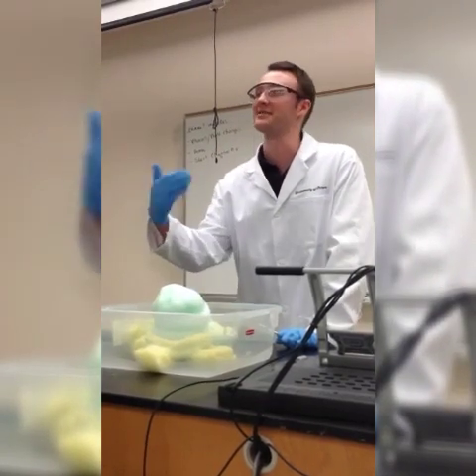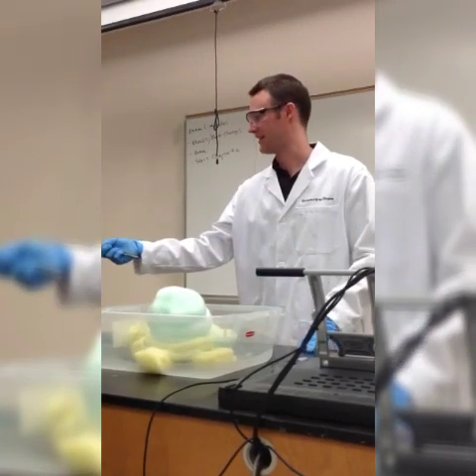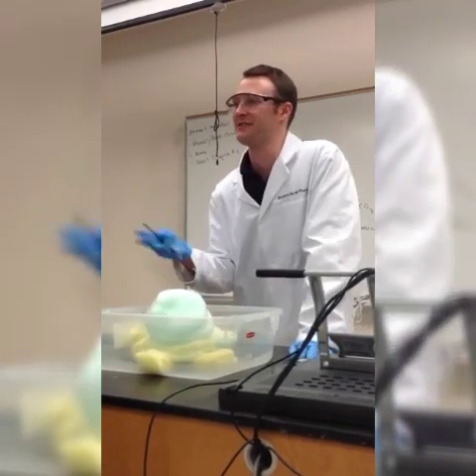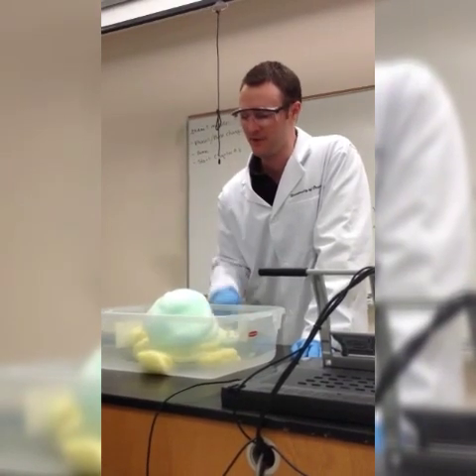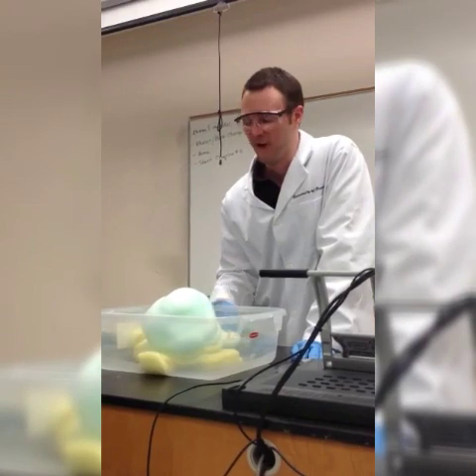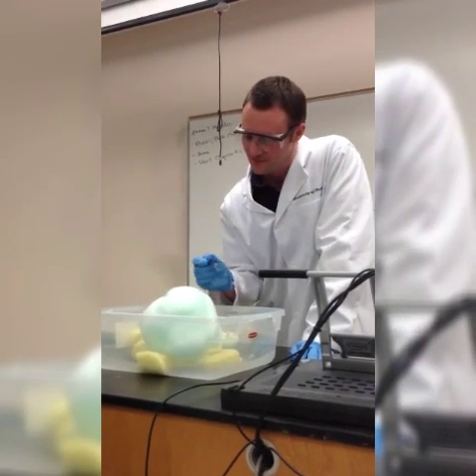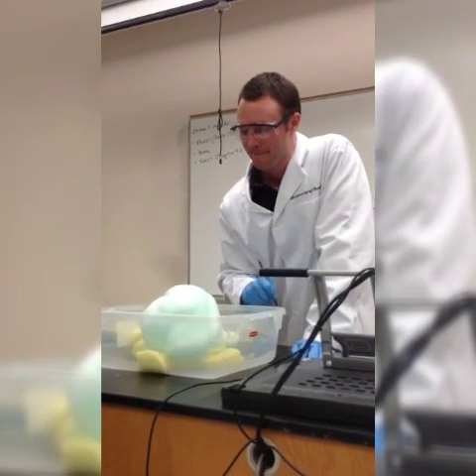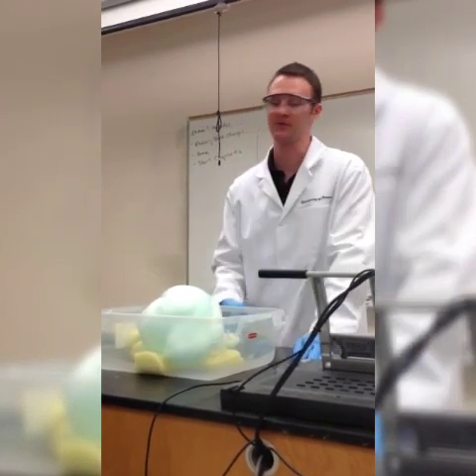And you can kind of smell it. I don't know if you can smell it. It's got kind of a soapy smell, and also a kind of cleaning powder smell. Well, I mean the peroxide, that sort of disinfecting smell. But it slowed down a lot, right? We just had a slow amount of bubbles coming out.